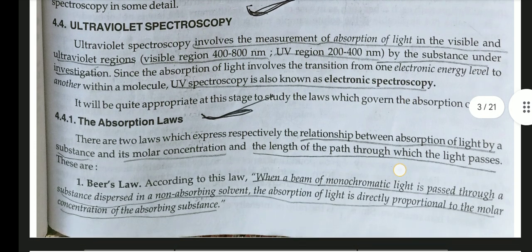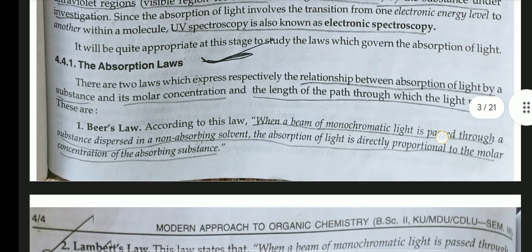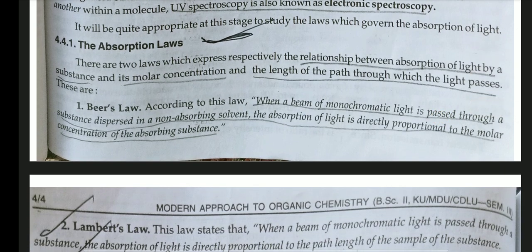Ultraviolet spectroscopy involves the measurement of absorption of light in the visible and ultraviolet regions by the substance under investigation. Since the absorption of light involves the transition from one electronic energy level to another within a molecule, UV spectroscopy is also known as electronic spectroscopy. It will be quite appropriate at this stage to study the laws which govern the absorption of light. The absorption laws: there are two laws which express respectively the relationship between absorption of light by a substance and its molar concentration and the length of the path through which the light passes.